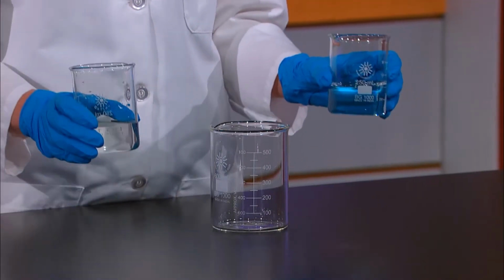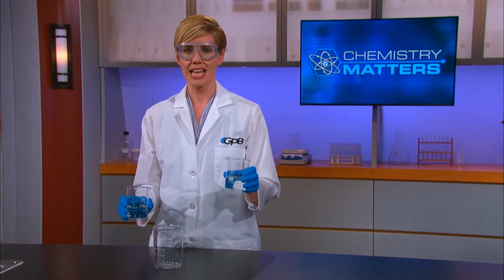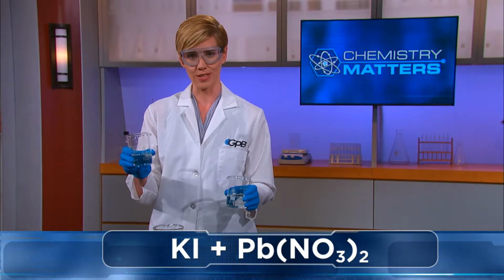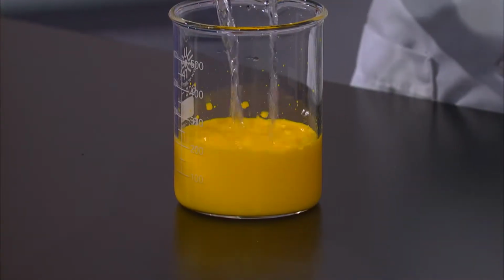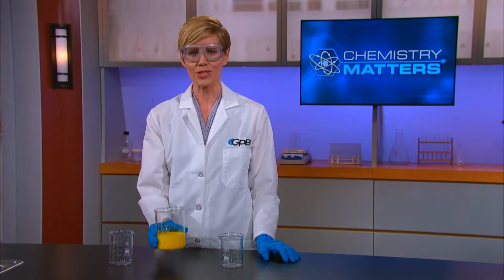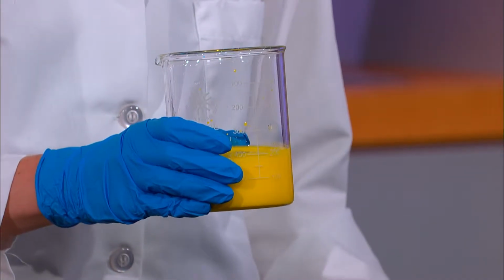I have 2 clear solutions. This one has potassium iodide, KI, in water, and this one is lead(II) nitrate, Pb(NO3)2, in water. Let's mix them together. Wow, that is a bright yellow. How did 2 clear solutions make a yellow product? Let's look at the reactants.